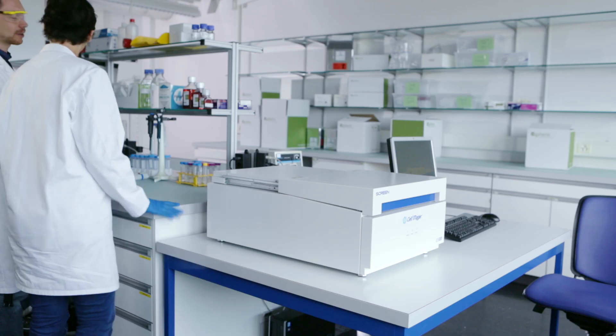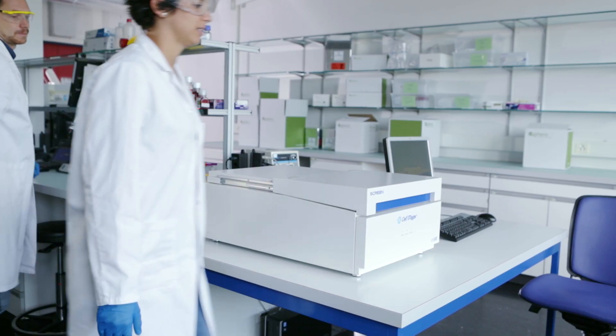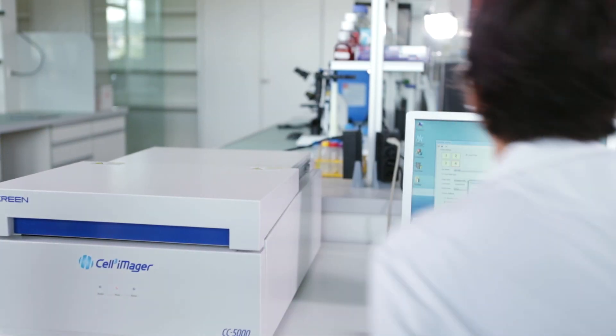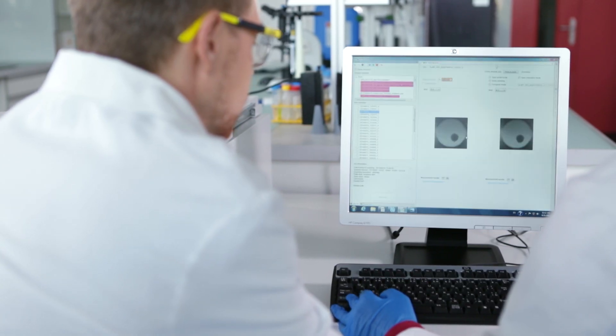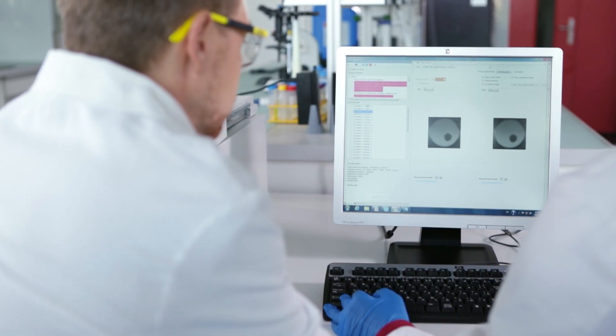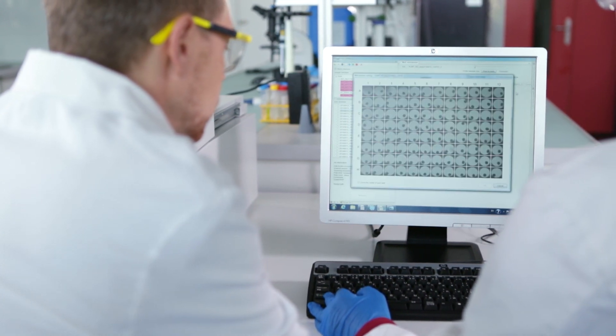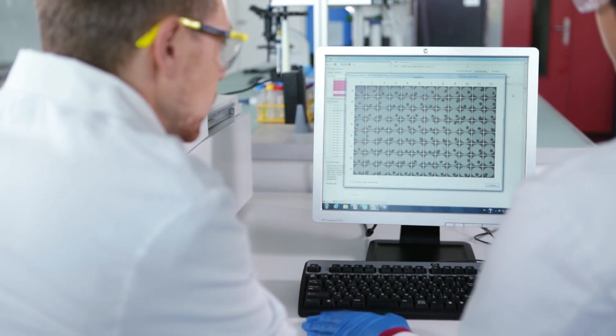Plate details and scan settings are then entered into the scanning software. After scanning, image analysis and spheroid measurement are conducted with user-defined recipes to identify, count, and measure spheroids in each well. Data generated are easily exported in CSV format for further analysis using your preferred statistical software package.